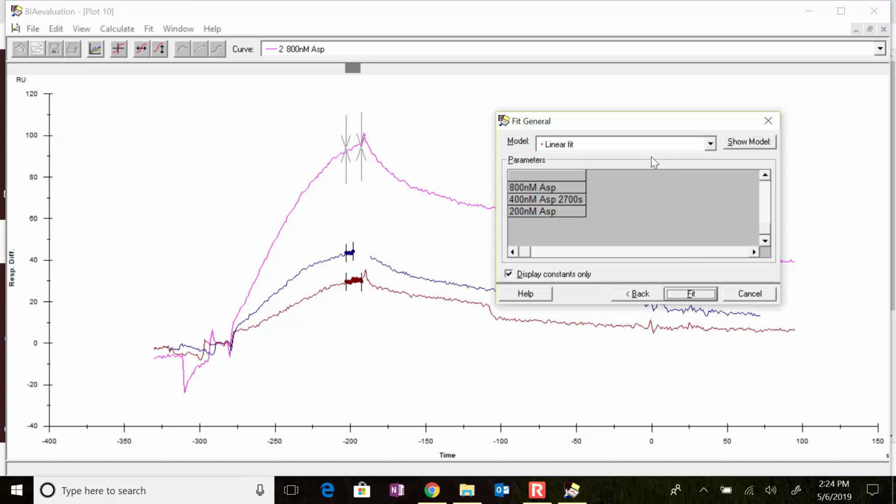And so after I've selected that, and notice how I selected it with the gray bar. The gray bar tells me what is the selected area of data. Okay? Here's where I want to know the average of each of those areas. This is where, number 1, you've imported the average model. If you don't have this option, that means that importing didn't go right, and so you want to go back and import it. But here it wants to know the concentration.